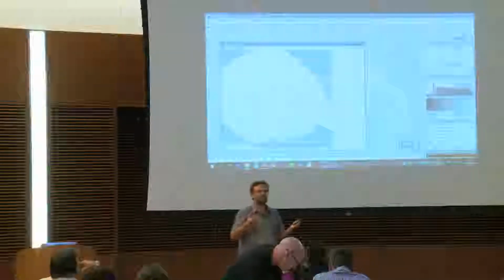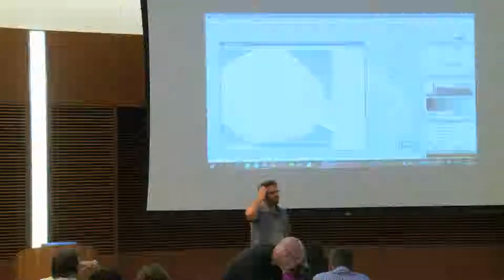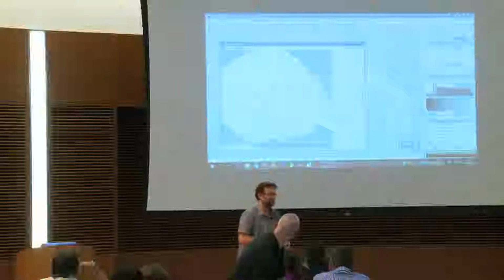Okay, so there is something obvious that you can say about the background. In fact, we have, let's say, 5 things that we can say. Can you tell me quickly? It would be so good if we can interact a little bit because I feel alone.